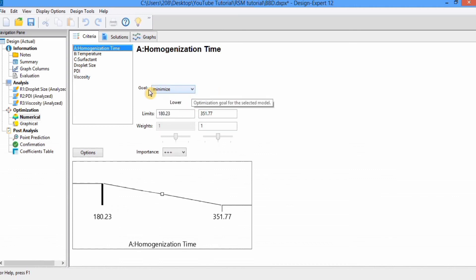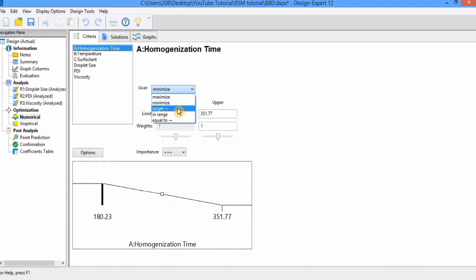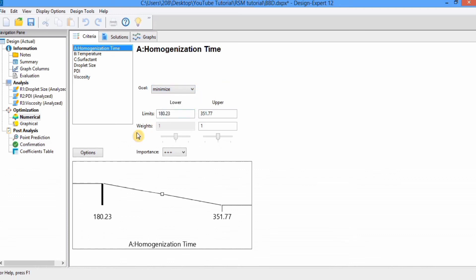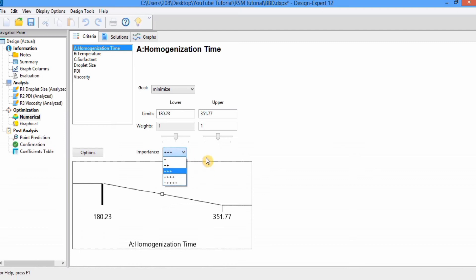There are different goal options. If you want to keep the value in a certain range, select 'in range.' If you have a target value, select that. You can also maximize, minimize, or set equal to a specific value. For weight, if factors are considered equal you can leave the value as is. For importance, if one factor is more important you can select 4 or 5 stars, and less important factors can be set to 3 stars. In this tutorial I will select 3 stars with equal importance for all, and weight will be 1.